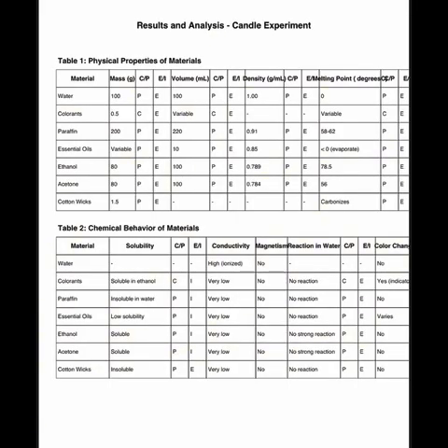Then we tested the solubility. In water, the paraffin was insoluble and just floated. In ethanol, it barely dissolved, but in acetone or hexane, it dissolved well, proving it's a non-polar substance just like other alkanes.